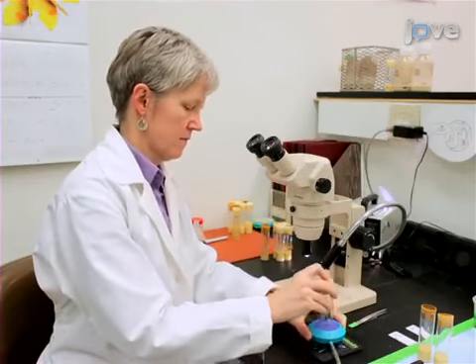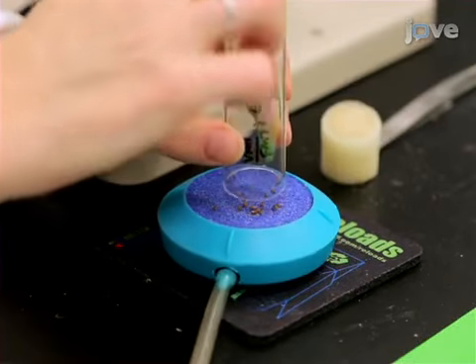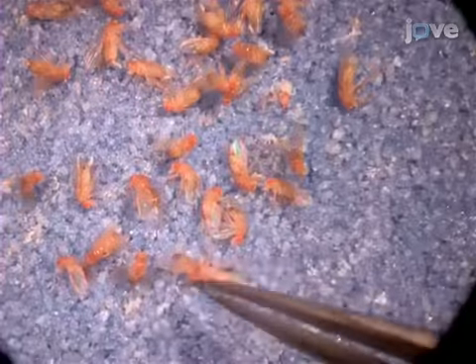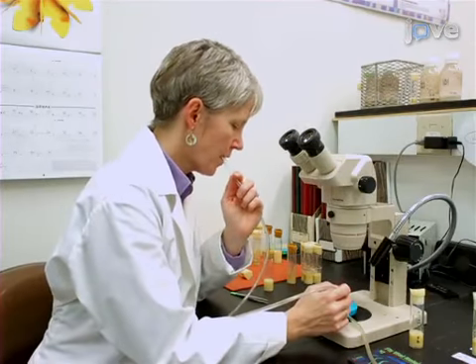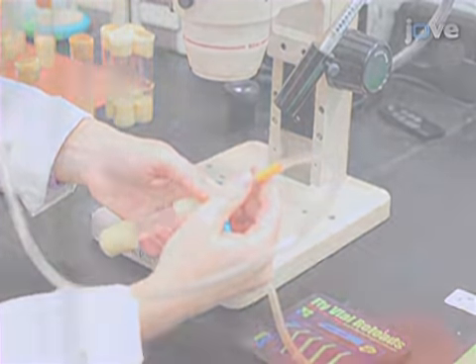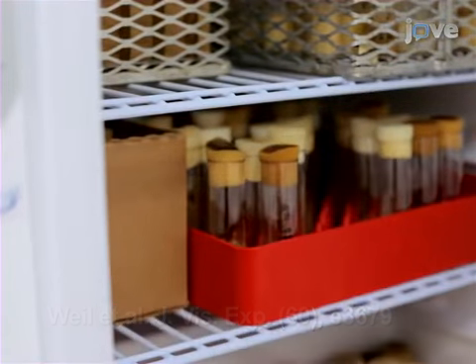First, anesthetize the healthy flies that are less than 1 week old and select 10 to 15 large females with rounded, cream-colored abdomens. Transfer the selected flies and a few males to a vial containing new, lightly yeasted food. Then, incubate the flies for 2 days at 25 degrees Celsius to fatten.